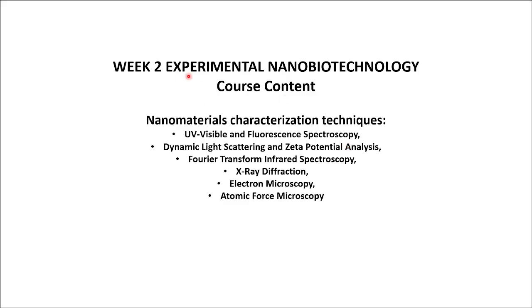Now, in this week's session, the week 2 experimental nanobiotechnology course content, this is the syllabus. There are different spectroscopic analytical techniques that we'll be discussing: UV visible and fluorescence spectroscopy, dynamic light scattering and zeta potential analysis, FTIR, X-ray diffraction, electron microscopy, and atomic force microscopy.